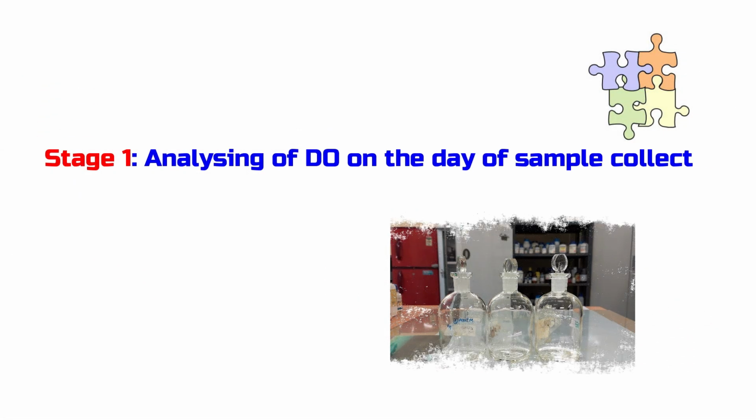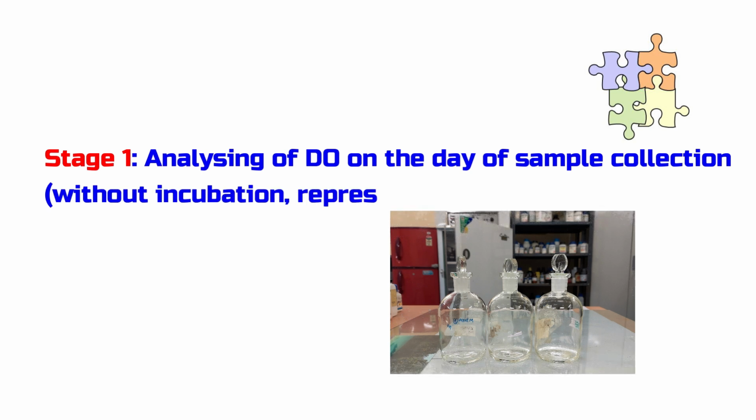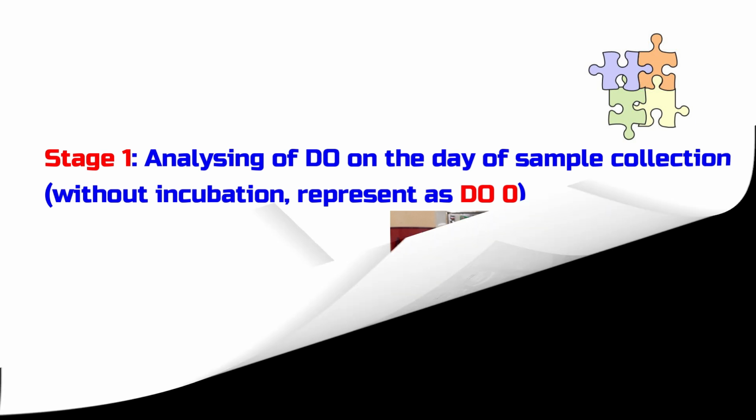Then the next stage is you can start analyzing the dissolved oxygen present in the transparent BOD bottles. And to do so, the step-by-step procedures involved are as follows.